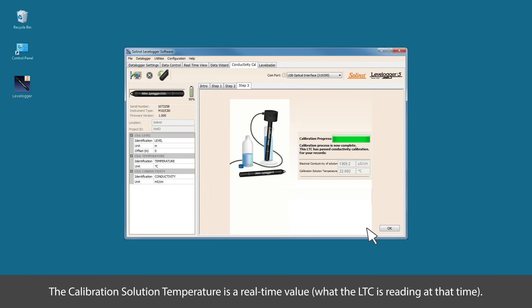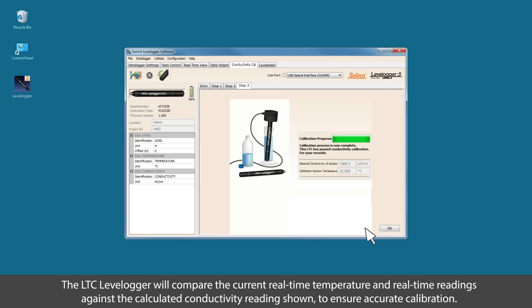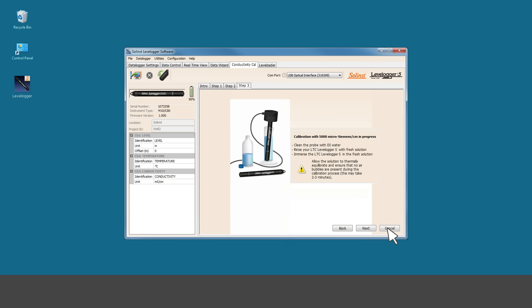The calibration solution temperature is a real-time value. Another value is what the LTC is reading at that time. The electrical conductivity of solution is a calculated value, which is based on the real-time temperature of the solution, the temperature coefficient that was entered in step one, and the calibration solution that was selected in step two. The LTC level logger will compare the current real-time temperature and real-time readings against the calculated conductivity reading shown and ensure accurate calibration.